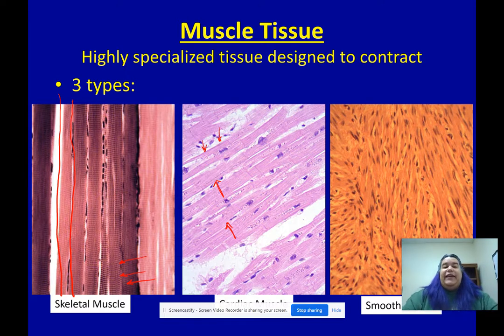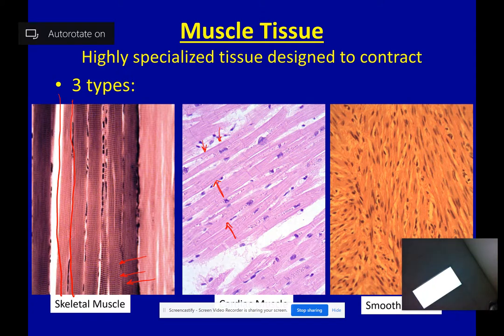So again, if you look at the skeletal muscle slide, you'll notice that I do have nuclei, but they kind of look like dashes, because I've pushed them all out of the way so that those little contracting fibers don't have anything blocking them from getting access to the active sites that they bind to cause contraction.